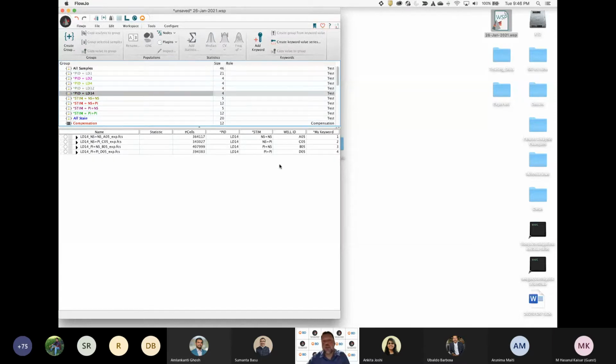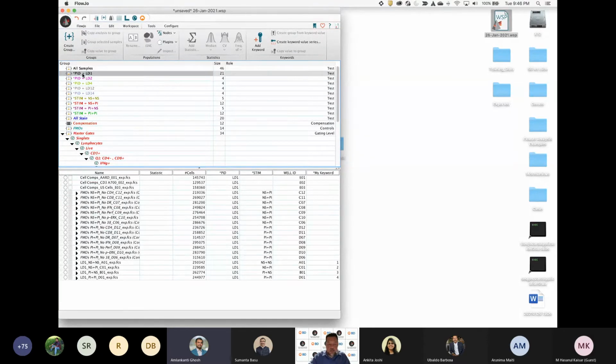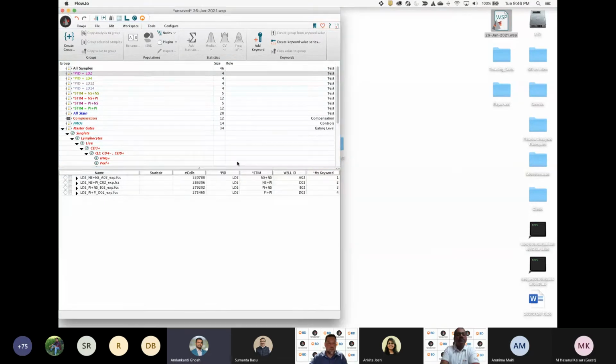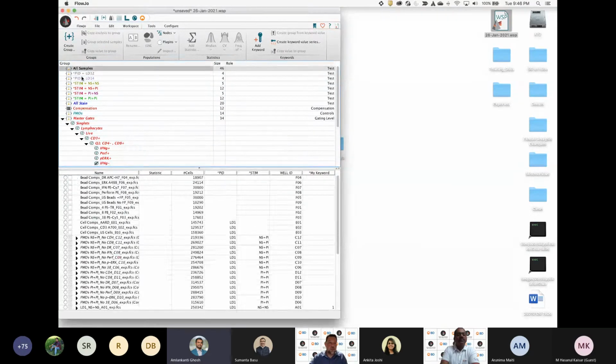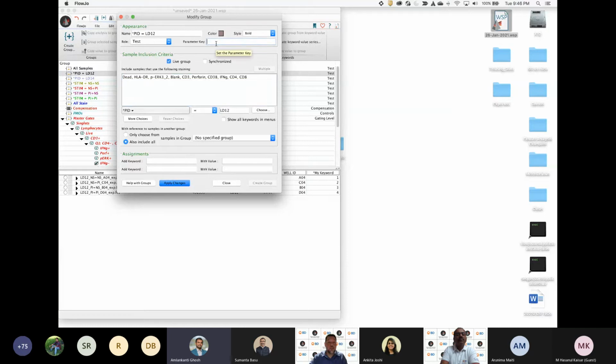What are you going to say, Milan? I'm sorry, was I off the mark there? No, I'm sorry, I just went in between. If you double click on any group, just to see the modify option, then I can probably show you. On the top right, there's an option, parameter key. Yes, I think that is the question Karuna is asking.